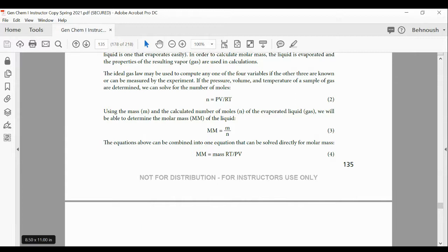And let's see if we had someone who answered. Okay. Millimeter mercury, but what pressure? How do you measure it, based on the procedure? Because you read the procedure before, right? The pressure of the vapor, how do you measure it? What equipment are you using to measure it?